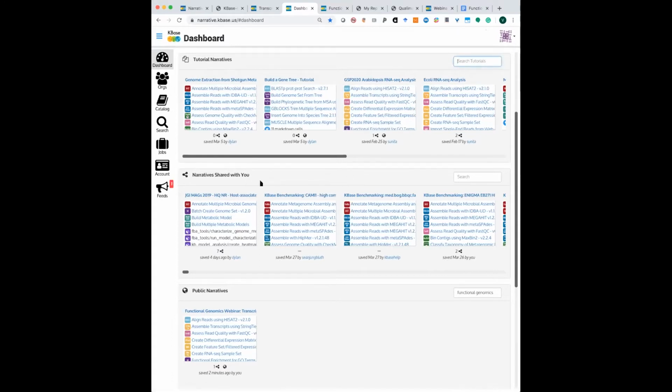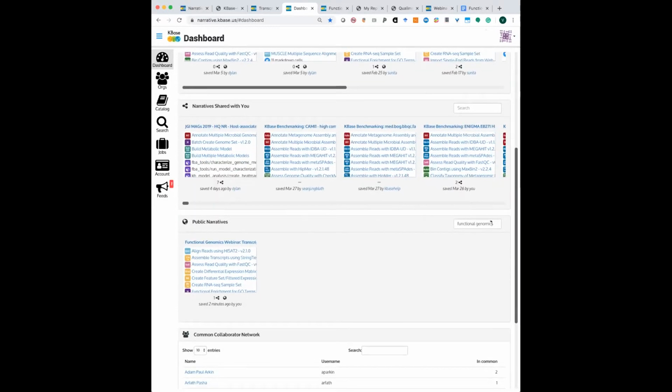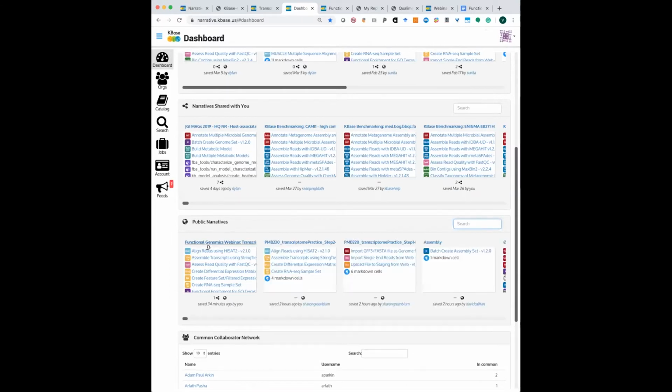Narratives that are shared with you by the people that you collaborate with. We have an extensive concept of orgs, which we'll be discussing in other webinars, but that's where it becomes very relevant for you working as a part of the team to have those shared narratives. And then the public narratives is where I have put the narrative today. So if you type functional genomics, you'll basically see a functional genomics webinar, and that's the webinar I'm going to be walking through today.